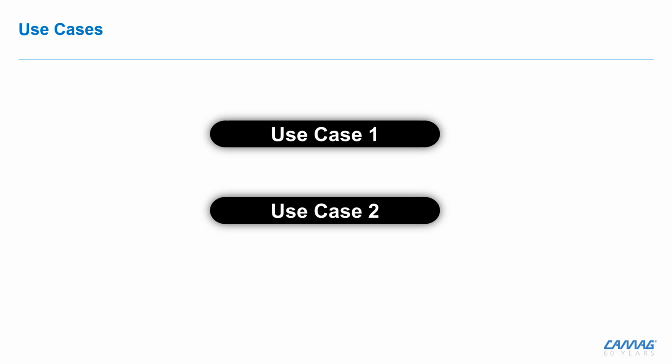And that was the second use case example. What I have presented today are just two examples. More example files that use different models and algorithms are available on the CAMAG website for download.